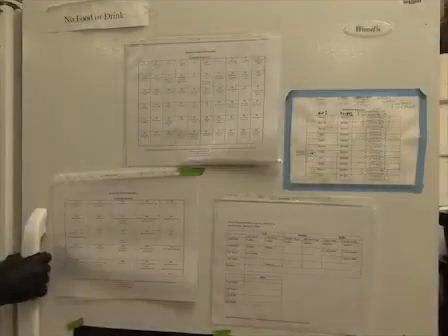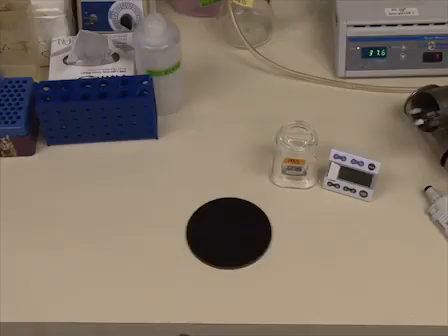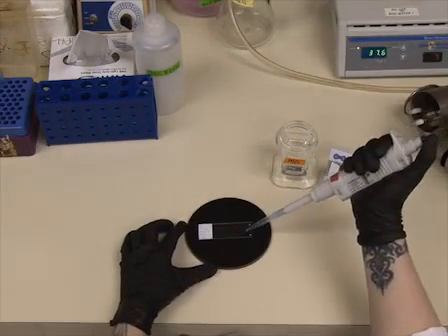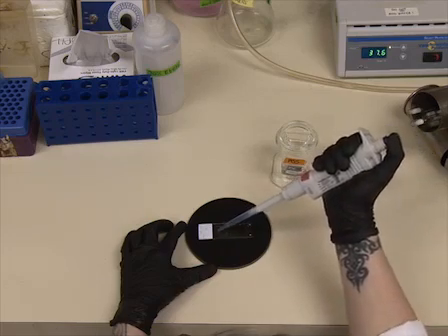For this step, take out the slides containing one of the serially cut neurospheres and include the slides with 5 previous and 5 subsequent sections. This will ensure you image the entire neurosphere. Using a nuclear counterstain will be a must in order to find all the sections of your neurosphere, so keep this in mind as you plan out your immunostaining.